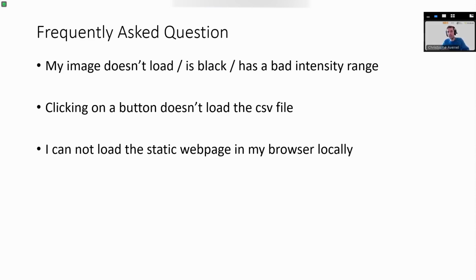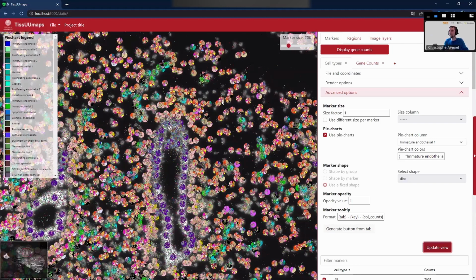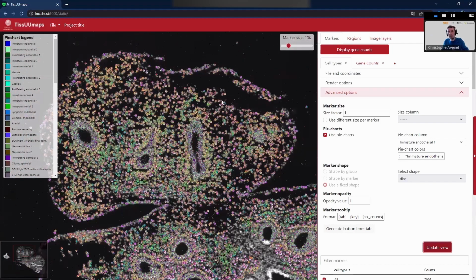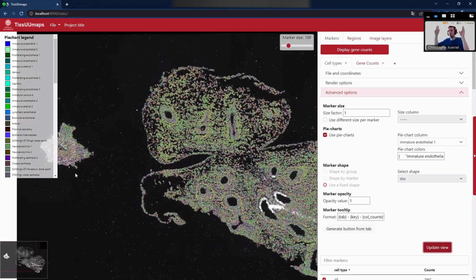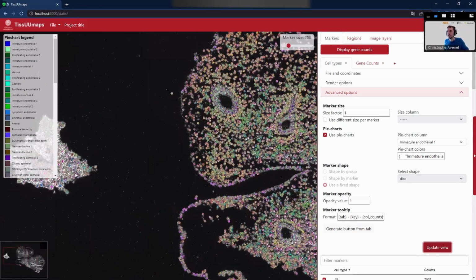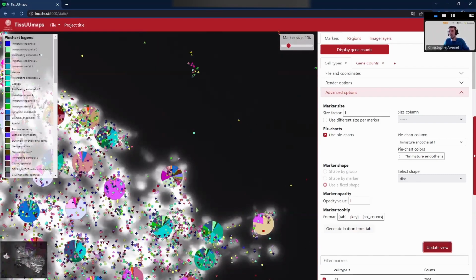Another thing is that the file needs to be pyramidal, so that it's fast to go from the very zoomed image to the unzoomed one. So pyramidal means that inside your TIFF image, all these different scales are saved as different layers. And then when I access one point, instead of loading the whole image, it will just access the correct scale and the correct position of the tiles, and then just send these.